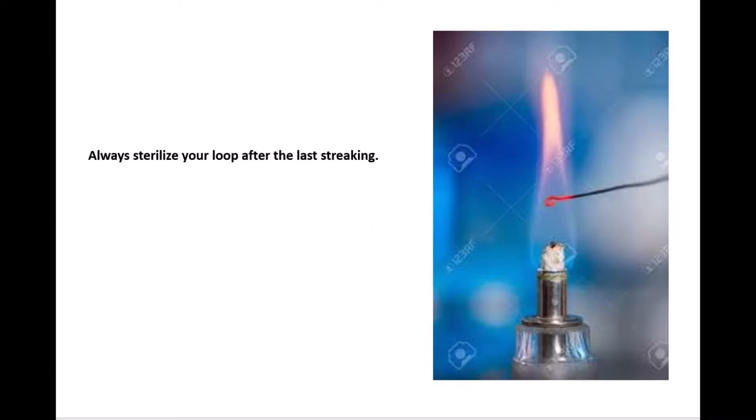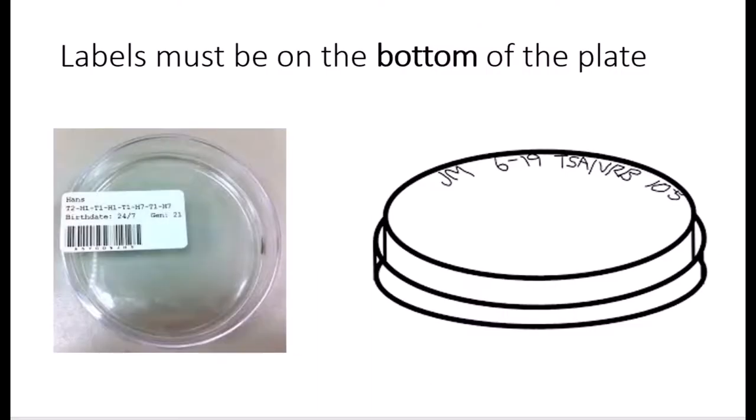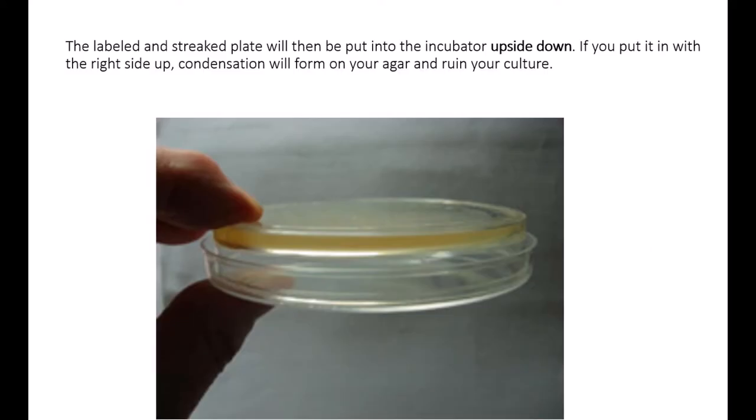Now you got to label these plates. In a hospital setting, you'll have a barcode that you will match up with the patient's bracelet so you know you've got the right patient. In a lab, you're going to probably take a little Sharpie marker and write on it. Now you've streaked this plate and you're going to turn it upside down. The reason for this is there's going to be condensation in this nice warm incubator. If you have your culture upside down, the rain falls down off the agar into the lid and all is well. If you turn it the other way around, rain falls off the lid down into the agar and you have a juicy yucky mess and you ruin your culture. And you have to start over which takes a couple of days.